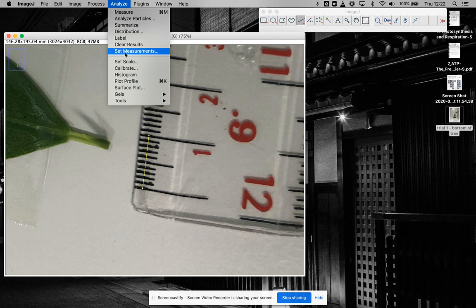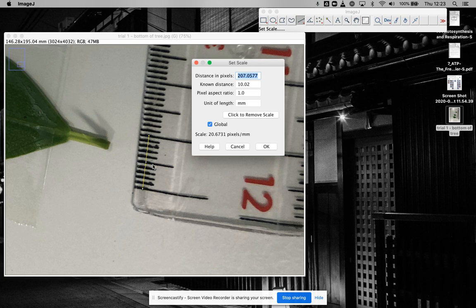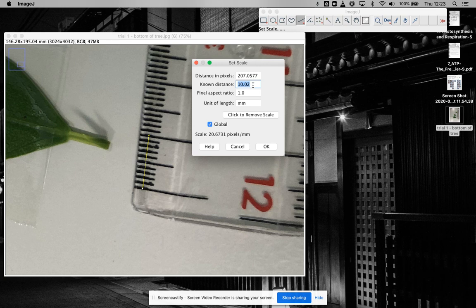I think I'll use centimeters. What I want to do then is go to Analyze and set scale. As long as I've drawn that line, it says right here that that line is 207.0577 pixels. And I know that distance to be one centimeter.